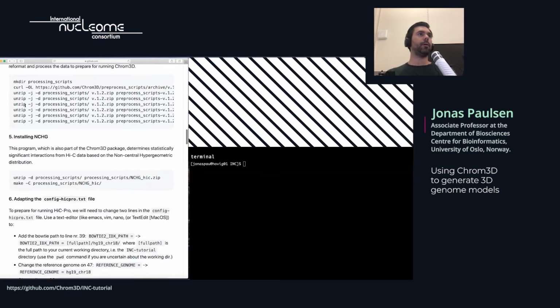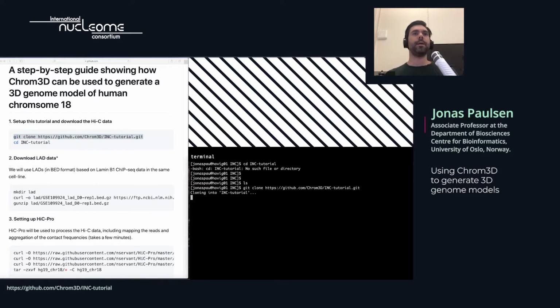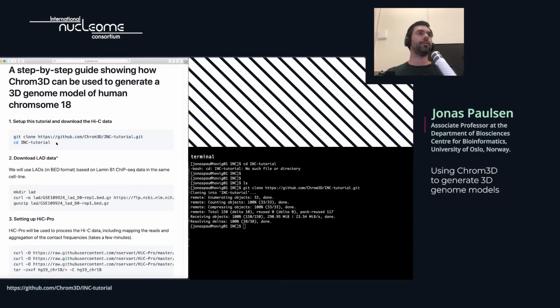Everyone has to set up the tutorial. I'll do that right now and ask everyone also to do the same. You can just copy these two lines. If you're running this on a Mac, you should be able to run the tutorial on your Mac. If you're on a Windows computer, you should be using PuTTY, for example, to log into an external server. Or if you have a Linux computer, you can just also run it on your computer. So what we've done here is just downloading today's tutorial.